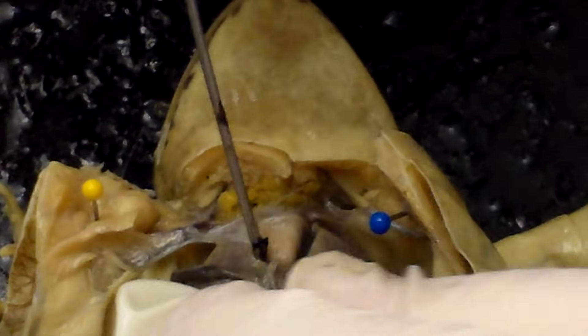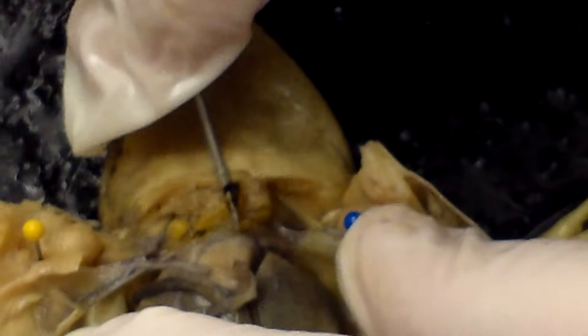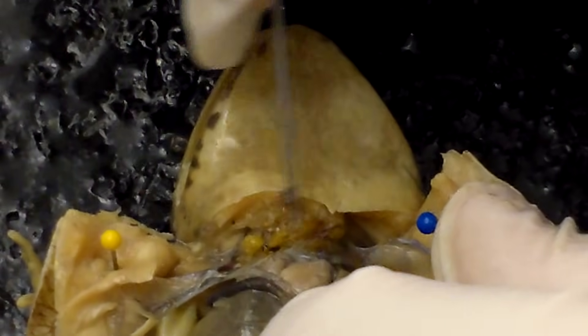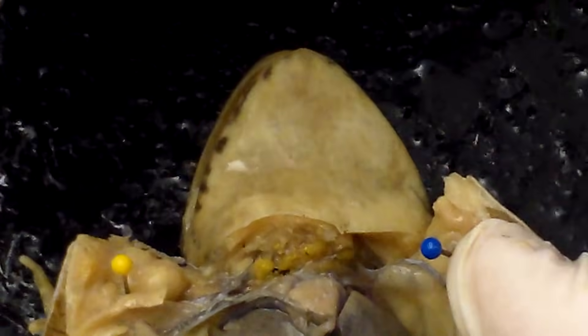Up here there's a tiny little sac around this structure — this white structure right here is the frog's tiny little three-chambered heart. If we take the membrane off — the membrane is called the pericardial sac, which protects the heart — you can actually see different colors of the chambers. The bottom chamber, the ventricle, is white. There's an atrium up here and another atrium right here. The two atria fill the ventricle, and the ventricle pumps blood out to the rest of the body.